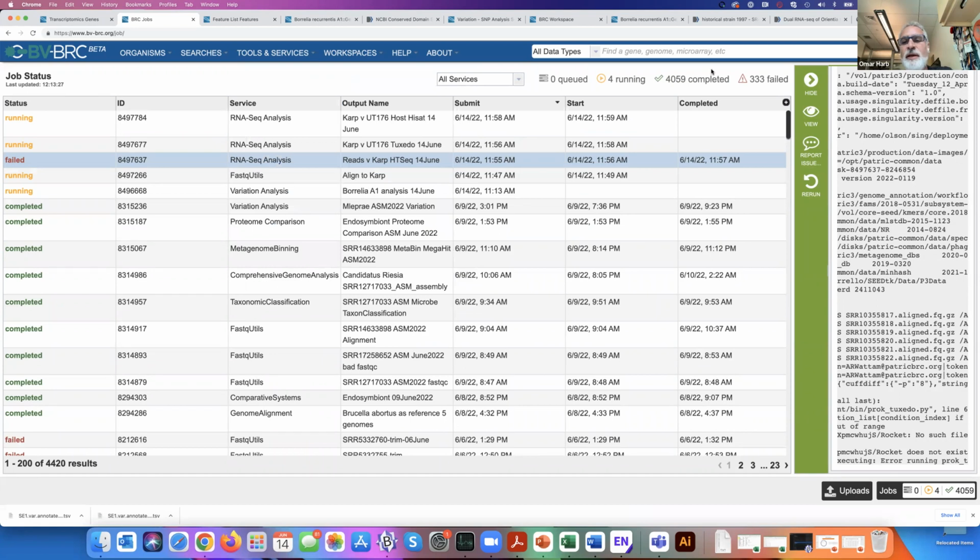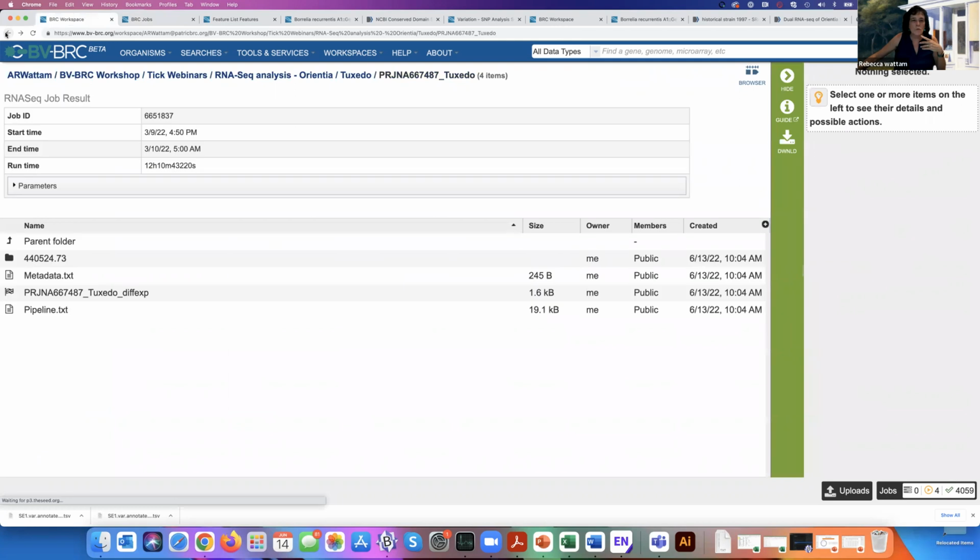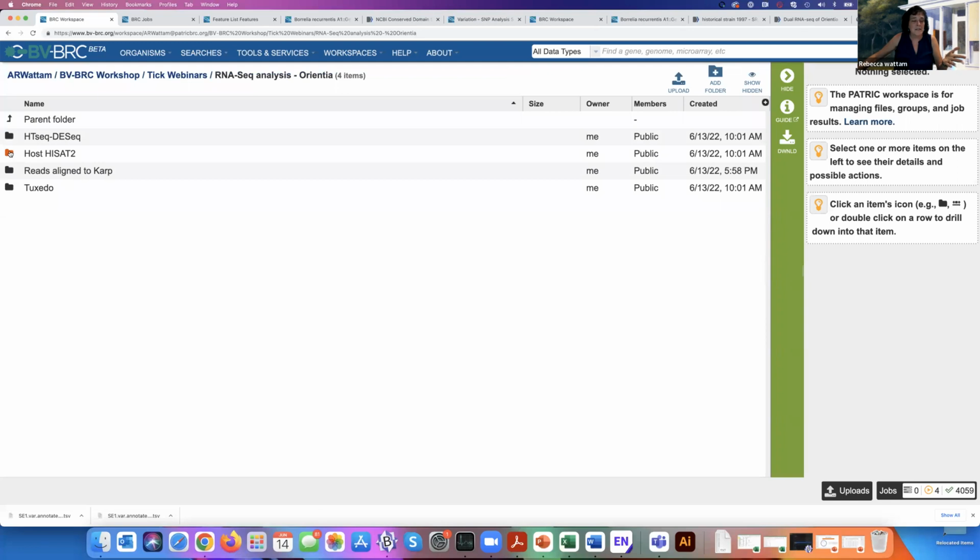There's a question from Dina Amin, she's just asking how many replicates. I'm assuming this could be two types of questions. One is how many replicates can you actually load? And I'm assuming that's limitless. But the other is, will it run? Every job that we have, generally we try to allocate an amount of time and memory, so we try to average things. But if people are loading really big things, I'm trying to remember how long that human host thing went, the jobs will sometimes fail because it outran the time allotted to it.